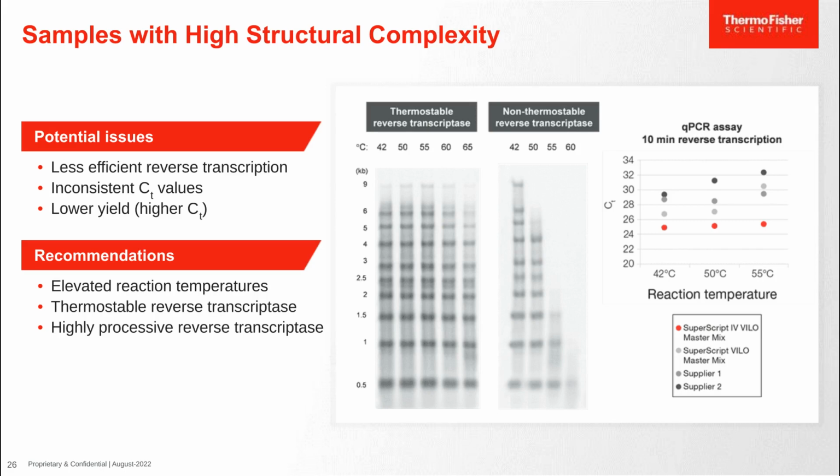Your inclination may be to run your reverse transcription reaction at a higher temperature to release the secondary structure. Makes sense. Be careful, however, when doing this, because elevated temperatures can often denature reverse transcriptases, especially wild-type natural enzymes such as AMV or MMLV RTs.